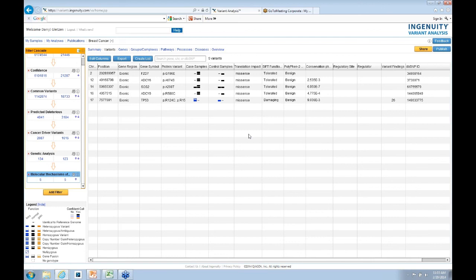When I was looking at my PGP data, my assumption is if it's occurring at 50% in my random control sample set, it's probably artifact. It hasn't been reported in the other large databases, so it's probably something unique to my platform. That's an assumption I'm making. Life is full of assumptions, and so yeah, you don't really know.